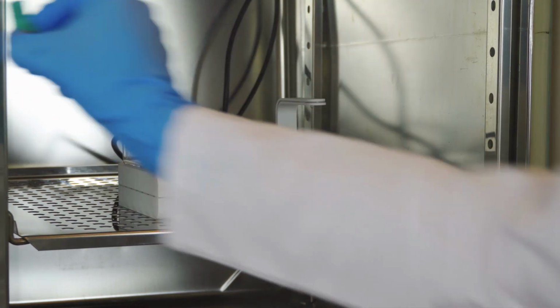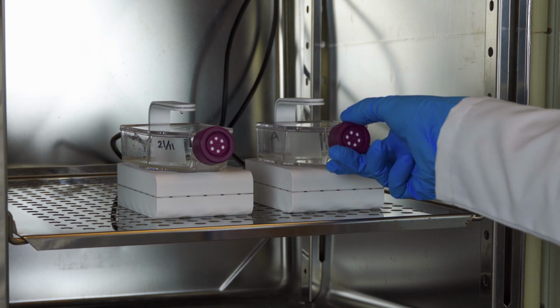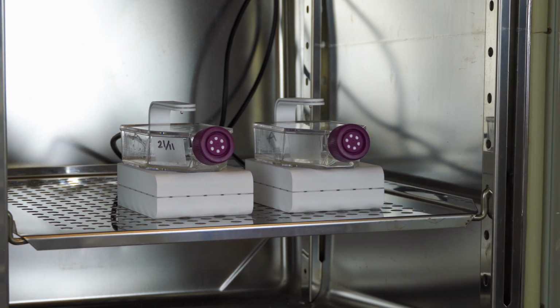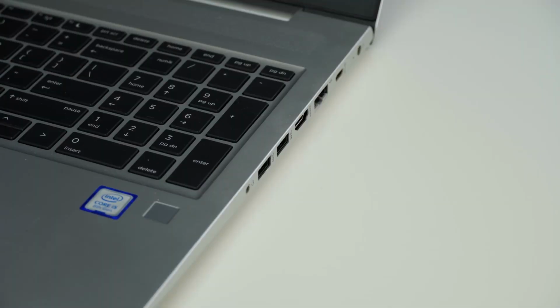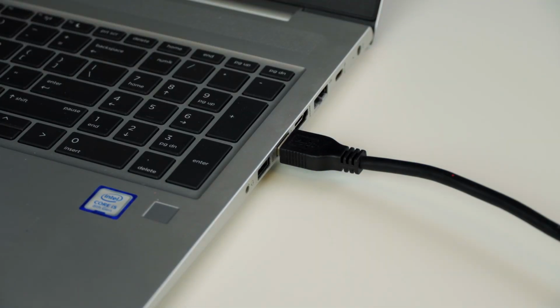To start your experiment with the Lux2 Dual Kit, simply place your culture vessels on the sample stage. The open design accommodates flasks, multi-well plates, and petri dishes. To connect the first device, insert the wire into the USB 3 port of your PC or laptop.